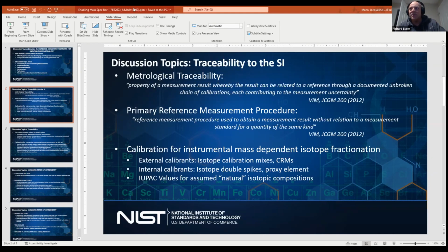One last comment is something that we run into frequently, and Jackie touched on this earlier with the 3000 series SRMs, where people are using a reference material that was essentially for chemical assay, specifically for things like ICP-OES, but we're using it as a reference material for doing isotopic analysis of an element, or even using it as reverse spikes for determining amounts of nuclides.